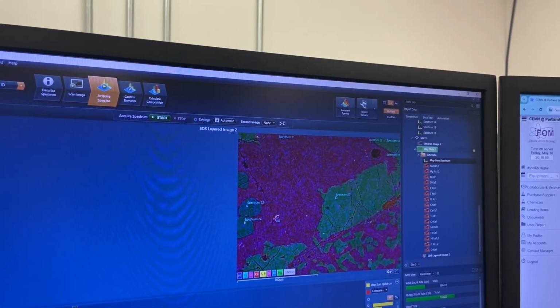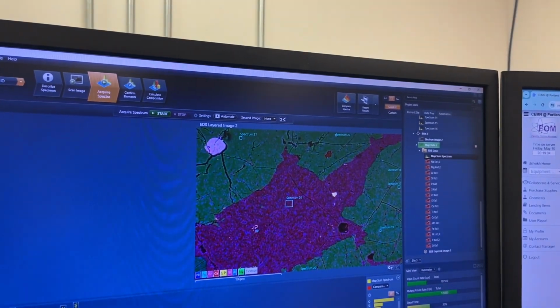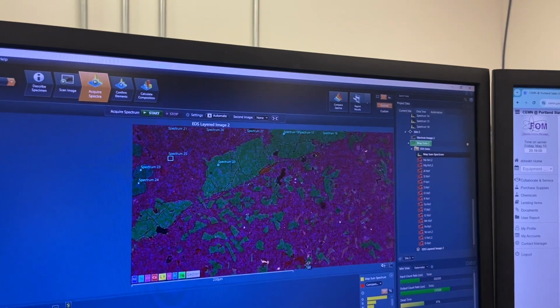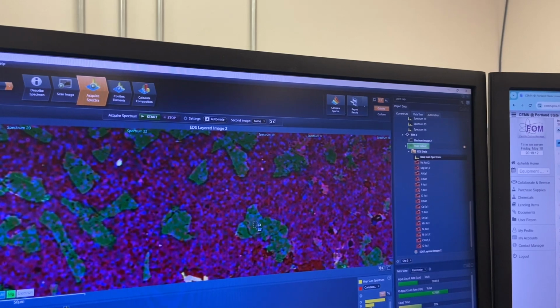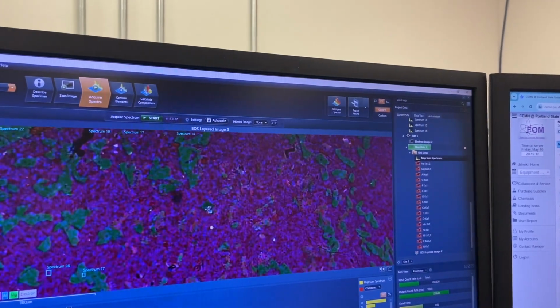I actually need to do research on these things. Great. Pink spinel troctolite clast in a lunar meteorite. How about that? I'm doing research on pink spinel anorthosite and we have a PST right next to it. That's really cool. Let's get some more of these olivines here. See, sometimes you're just doing classification and you find interesting stuff for research.